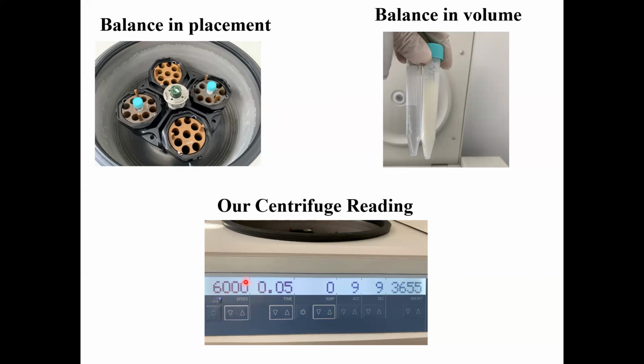We also have the time, 5 minutes. The temperature is 0 Celsius. The temperature that we're going to be using today is, for the most part, 0 Celsius. And these other values, don't worry about them. They're not that important.